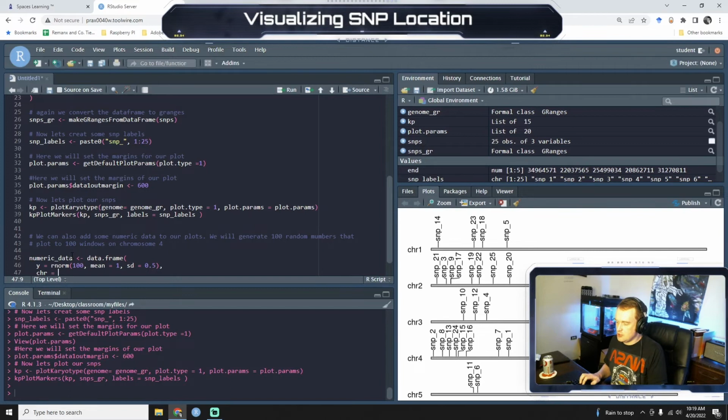And then for chromosome 4, we're going to break it up into 100 windows.